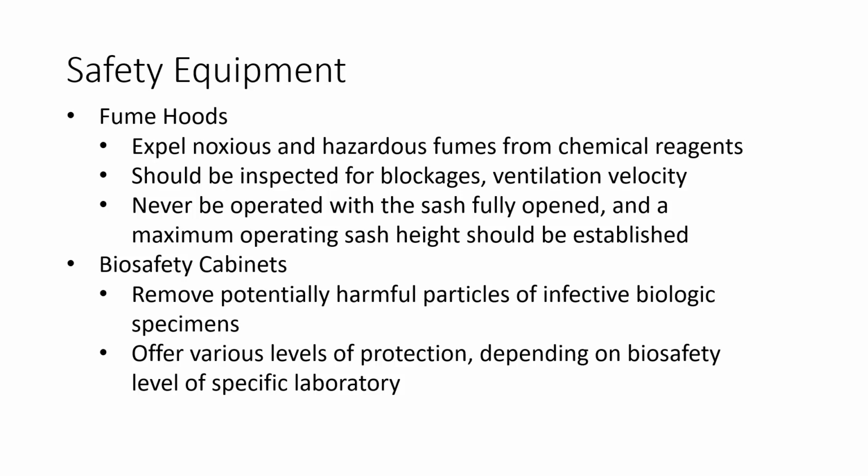There is a sash, so there's a window at the front of the fume hood, and that sash can be moved up and down. Most fume hoods have a space where it's safe to operate that fume hood, and if you move it above that line, you open up the sash too much, an alarm system will go off, and it will require you to lower that sash to an appropriate level.